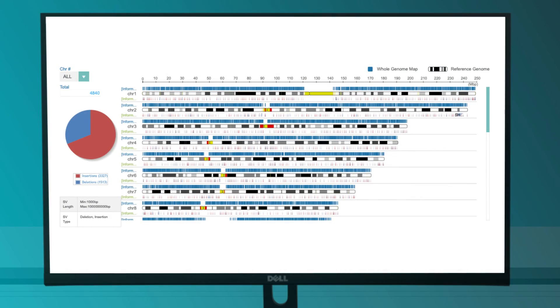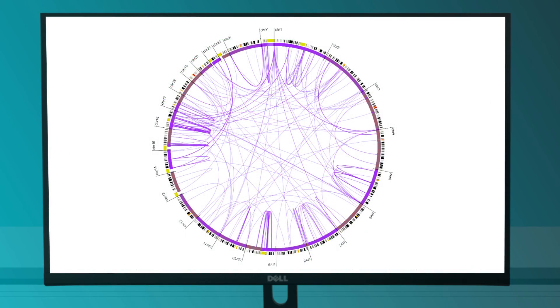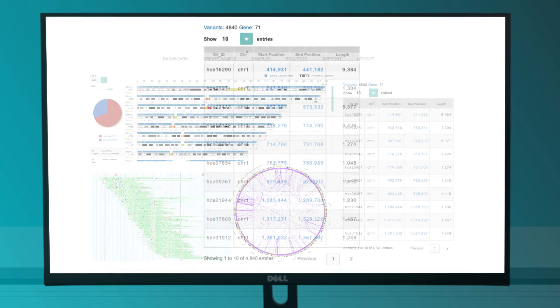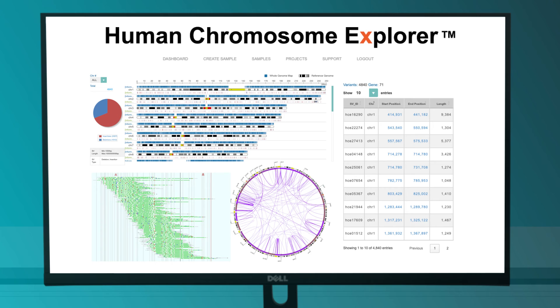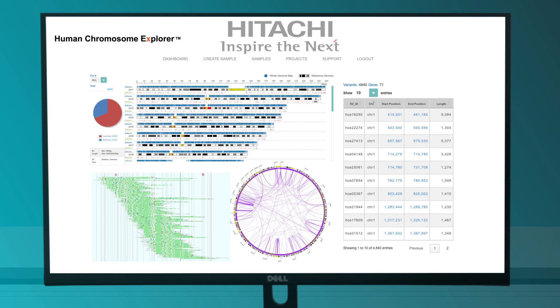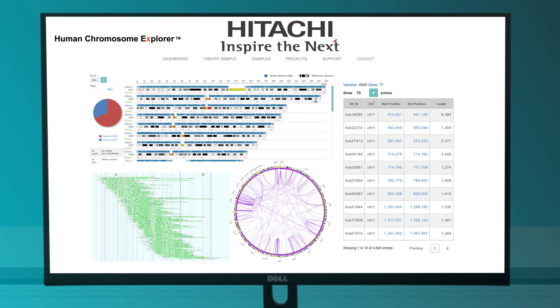This pipeline utilizes a user-friendly, cloud-based platform called Human Chromosome Explorer, powered by Hitachi High Tech for accessible analysis.